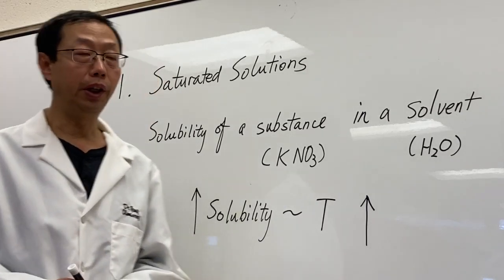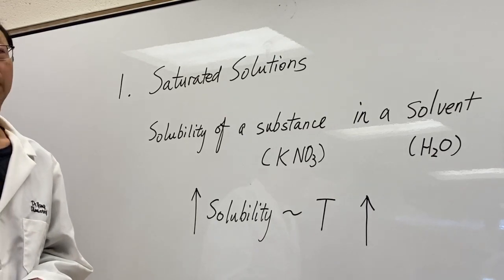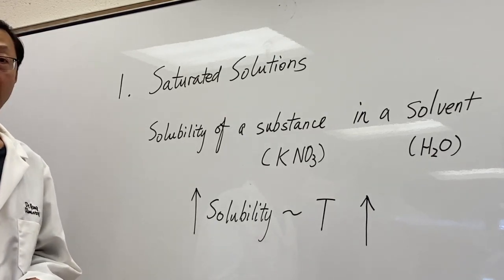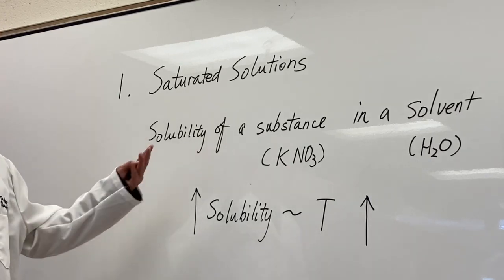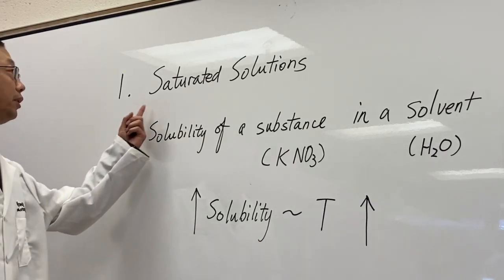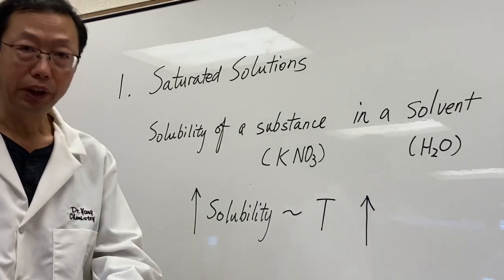This lab is experiment 12, solubility and solutions. There are 3 sections in this lab. We're going to discuss one section and do it, and discuss another section and do it. Okay, the first section is saturated solutions. We are going to make saturated solutions.